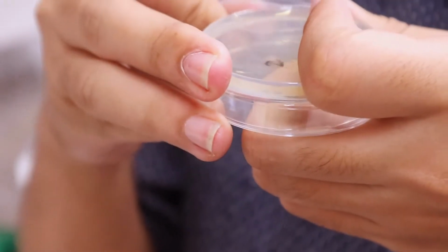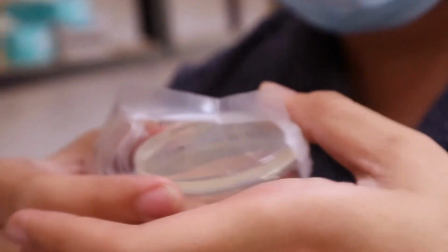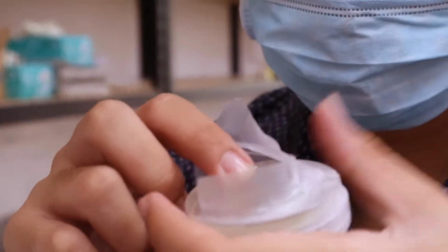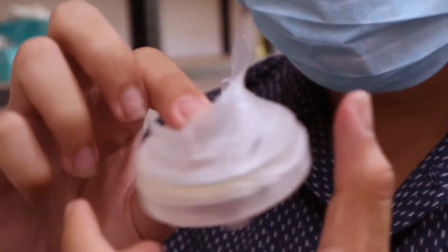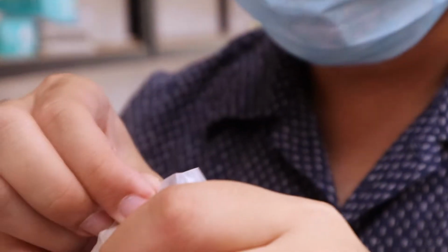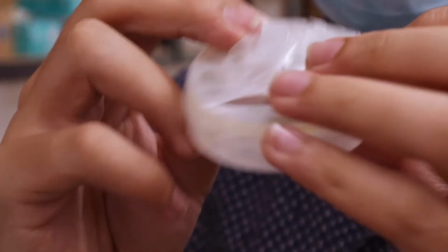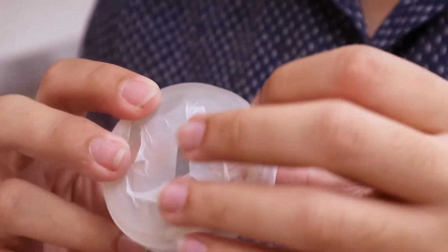Yeah, so one thing you want to do is flip it and put this on the cover. Stretch this with full force. Ah! Oh no. I propose we keep this so people will know that we are not experts, we're not professionals, we make mistakes, and that's okay. Everyone makes mistakes in their lives. This is one of several mistakes we make in our lives, so it's gonna be okay. You did not cause a biohazard in this school, no one will die. So I guess that's one kind of success. You see? At least we've covered this semi-completely, quasi-completely, you know? I have a feeling that this will not cause any hazard in this school, so we're good.